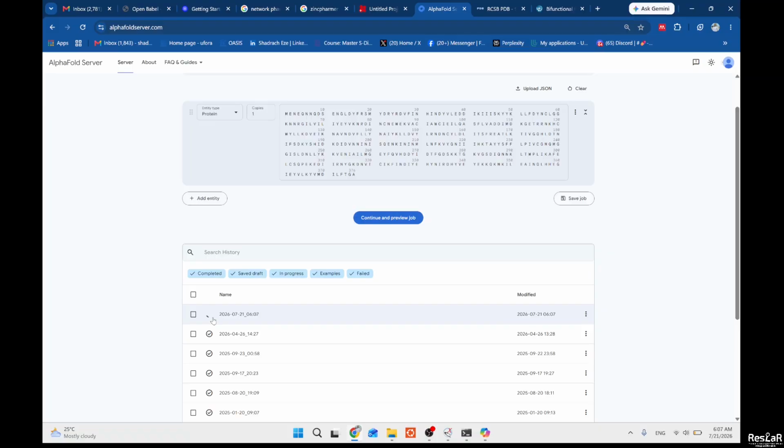and look at good criteria, quantitative measures that we can use to assess the quality of the predicted structures. And as I showed here, if you have cofactors like magnesium ions, ATP, ADP, or whatever is available, you can also create the model of this protein together with these structures.